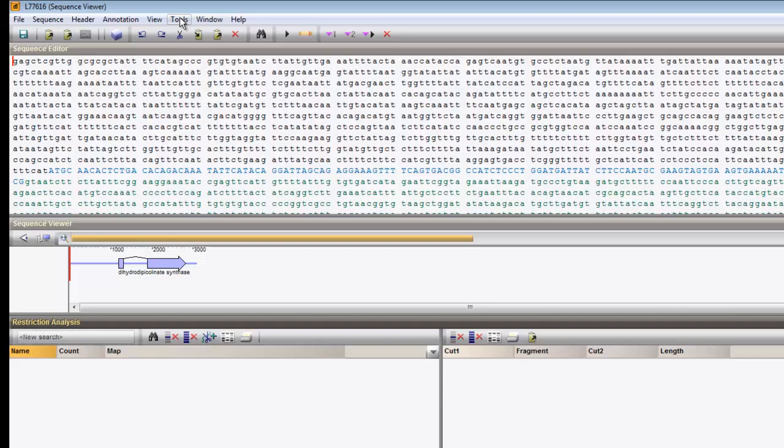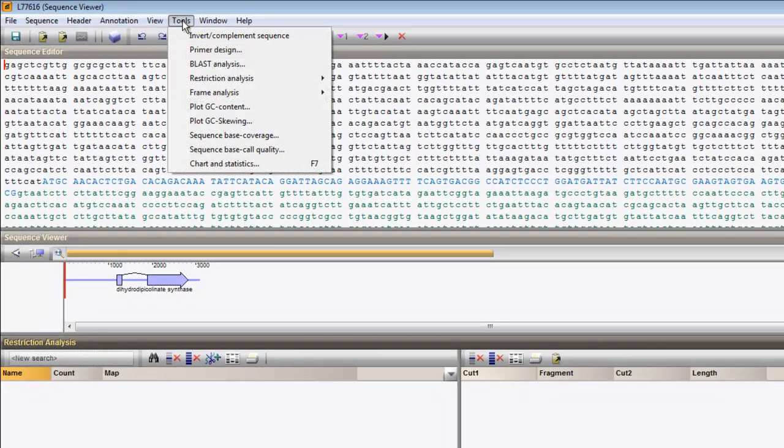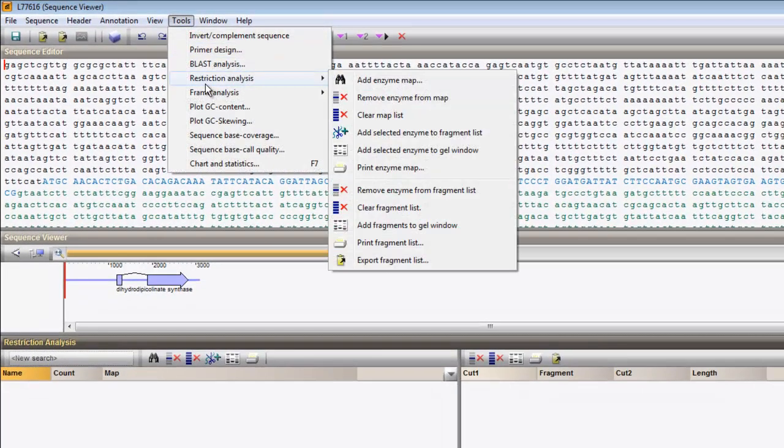Select Tools, Restriction Analysis, Add Enzyme Map.